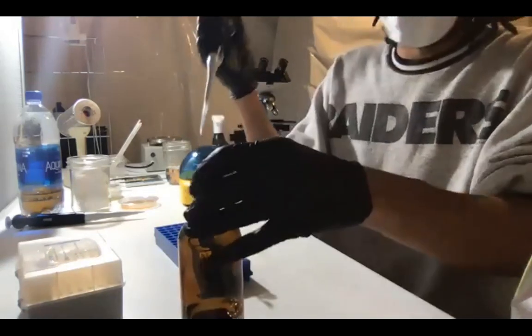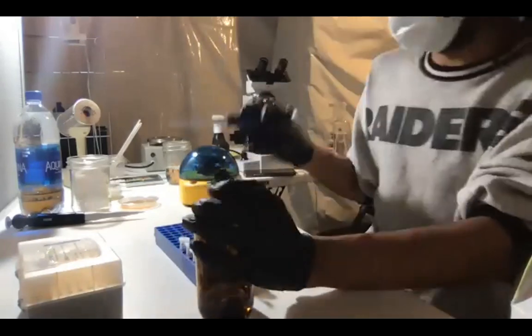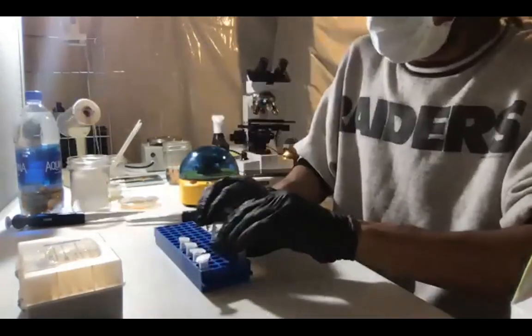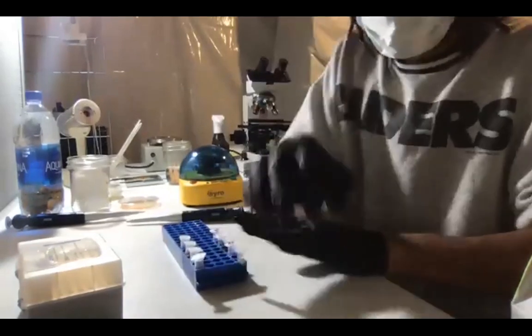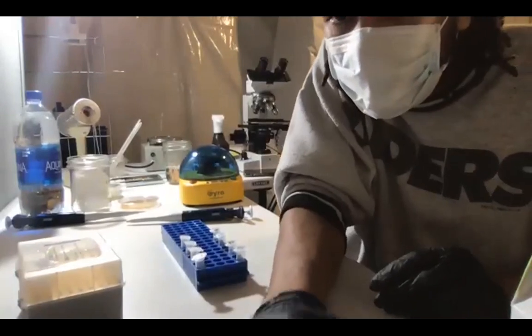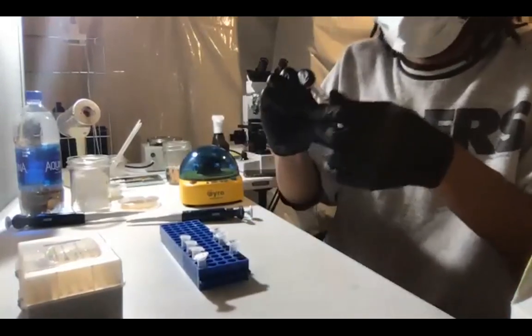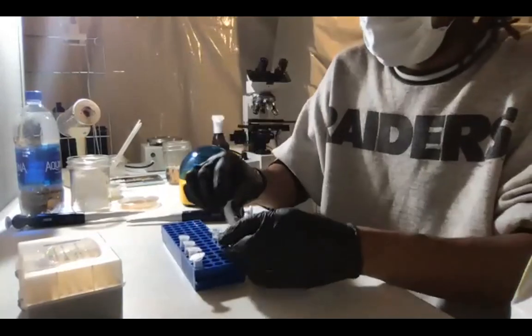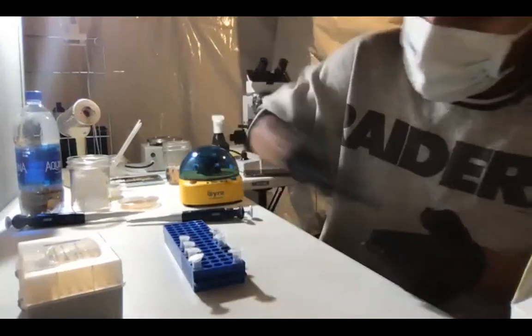All right, so I added 100 microliters of dilution solution into each of these tubes. I'm going to close them. And I'm going to shake it up. So each of them, just give it a nice shake so everything gets distributed.